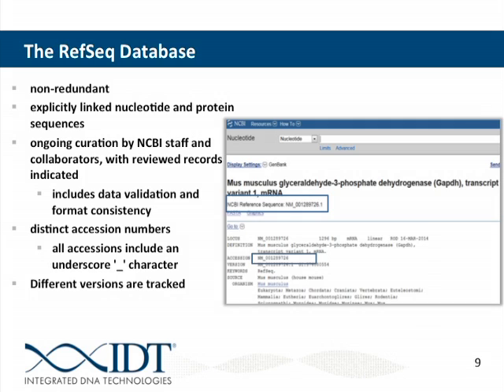Yeah. So you mentioned annotation errors in the previous slide. With respect to a reference sequence, what is an example of an annotation error? So in this case, in the RefSeq database, that's much less of a concern. These are curated, annotated, and tracked. It's more, and actually I think the next slide, yep. So any of the sequences that have an NM accession number have been curated, so they've been checked for accuracy. It's more of sequences like the AF or direct submissions, which have a different accession number, like... Or ESTs? ESTs, yep.